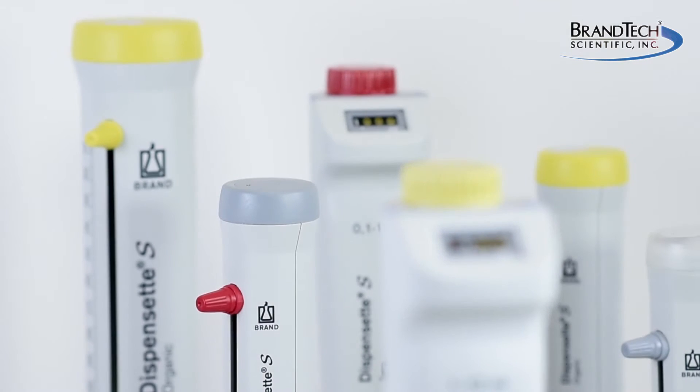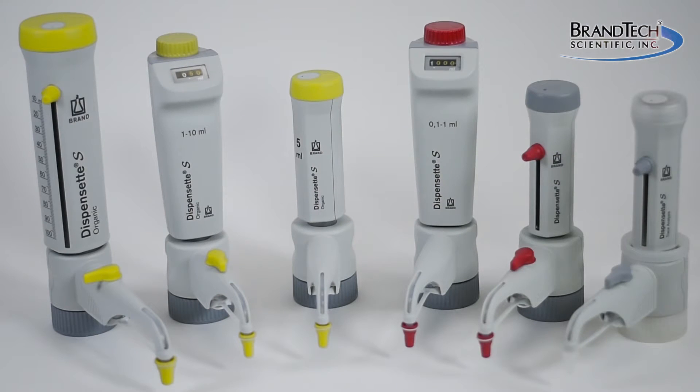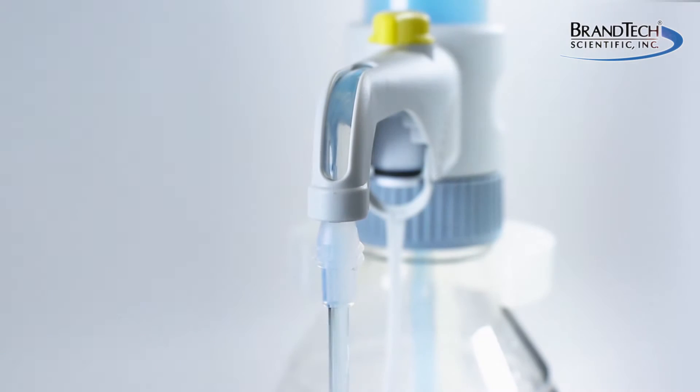BrandTech Scientific is pleased to introduce the new Dispensette S Bottle Top Dispensers from BRAND. Manufactured in Germany, they represent a half century of expertise in making the world's safest bottle top dispensers.